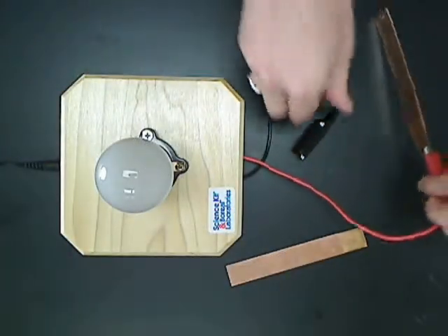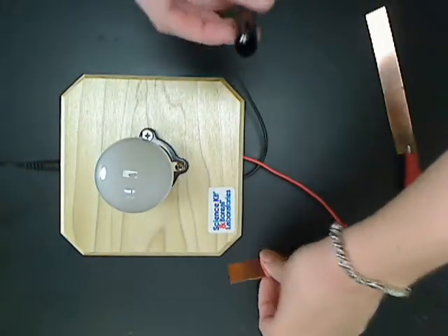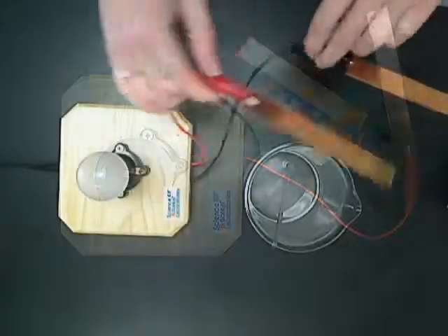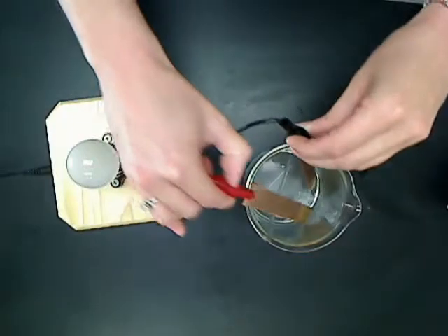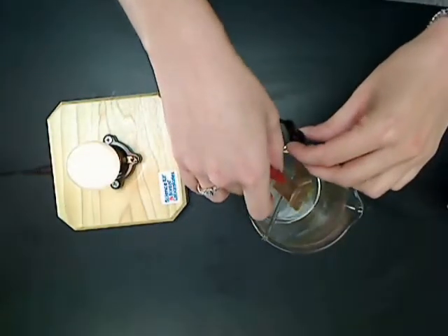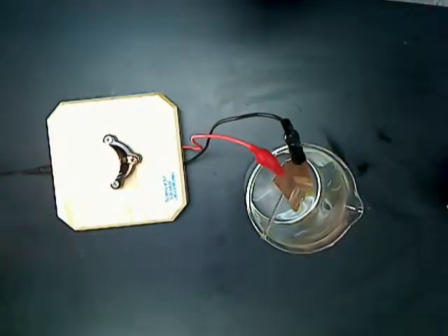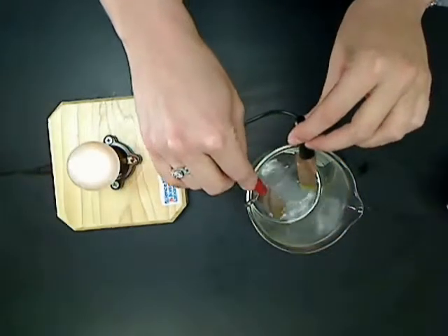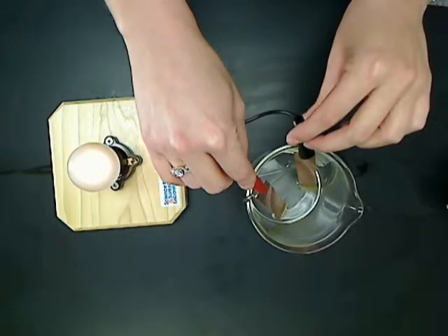Then, hook the alligator clips from the indicator onto the end of each copper electrode and place both electrodes into the liquid to test the conductivity. The intensity of the light, or lack thereof, on the indicator will show how conductive the liquid is.